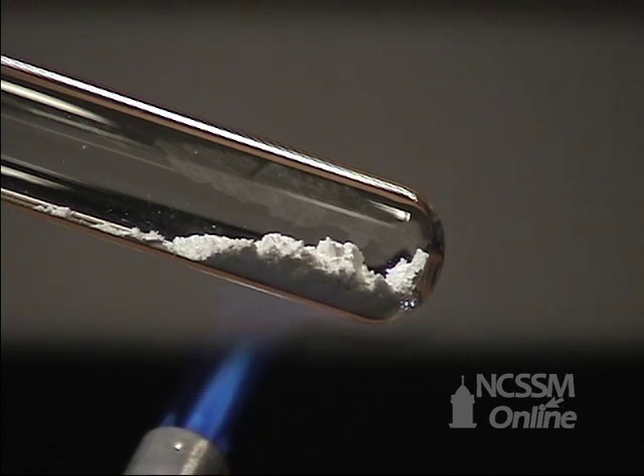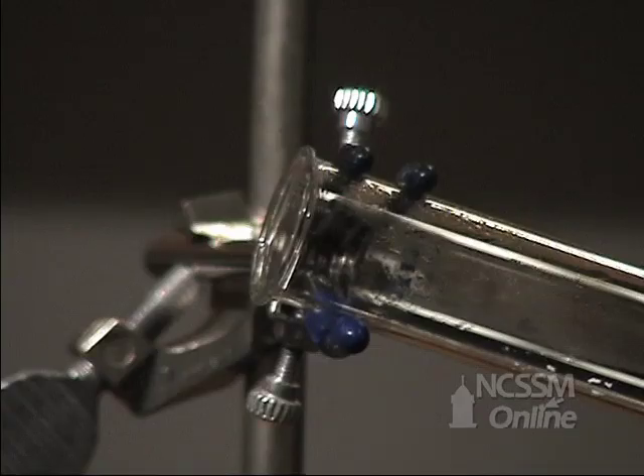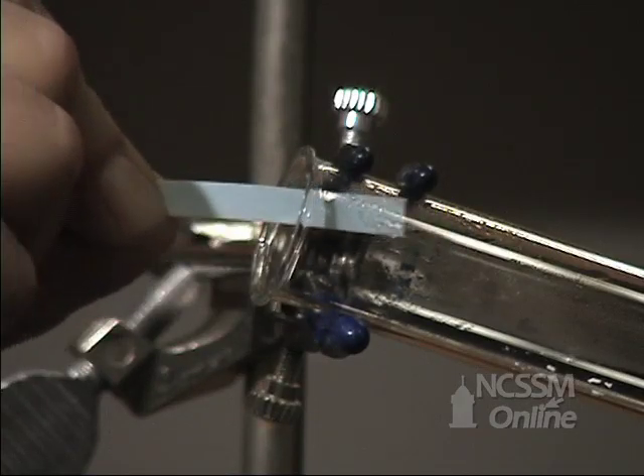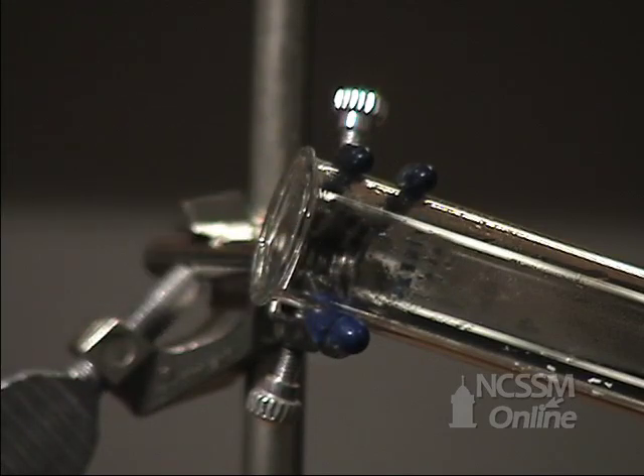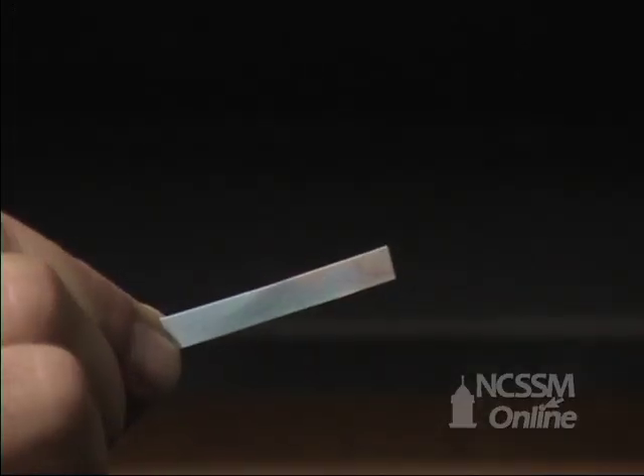If we heat calcium hydroxide, we will produce calcium oxide and water vapor. The water vapor condenses at the top of the test tube, and we can test for the presence of the water using the cobalt blue paper.